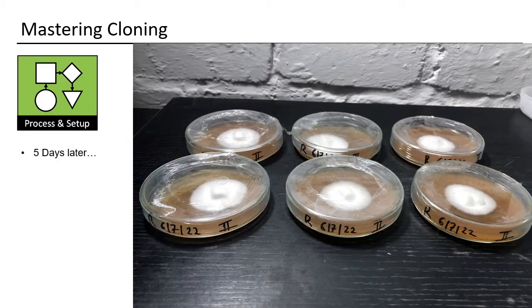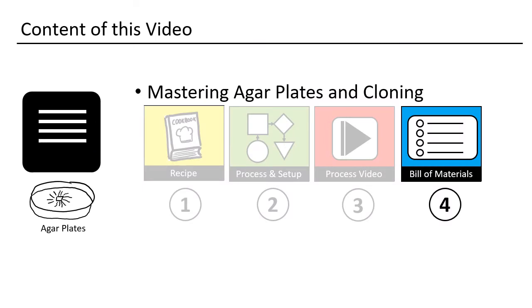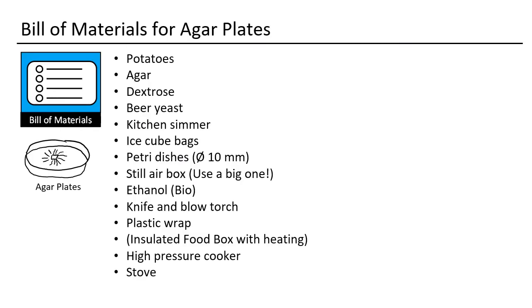The process went fine. No contamination. Growth speed depends on strain. After the petri dish is fully colonized, I store them in a regular fridge. Now we will have a conclusive look at which materials you need. You need the organic materials to create the agar base. And you will need the equipment. All the items have been shown previously.